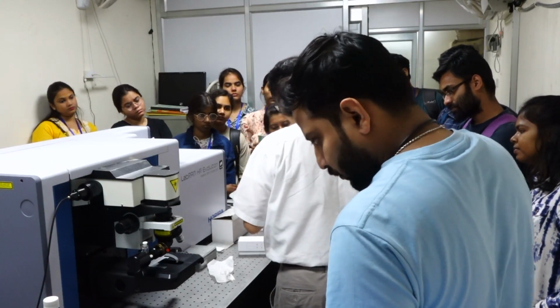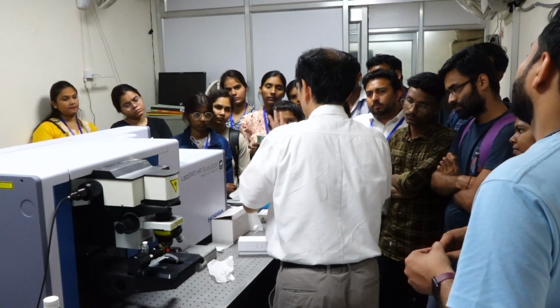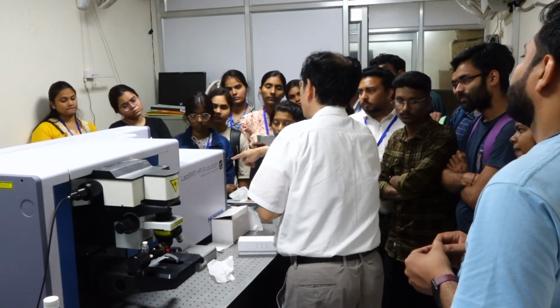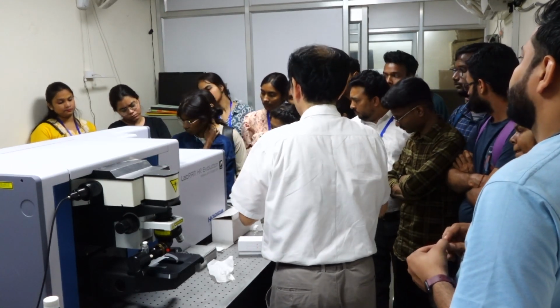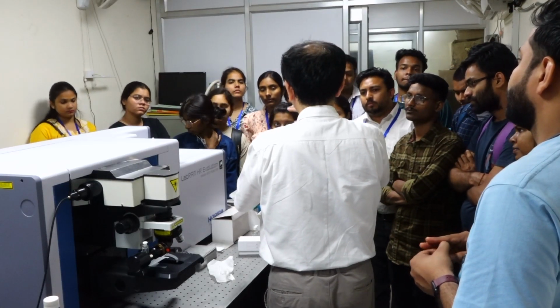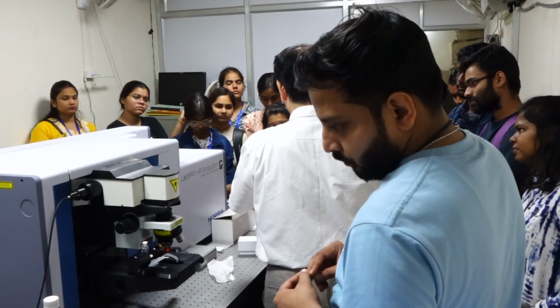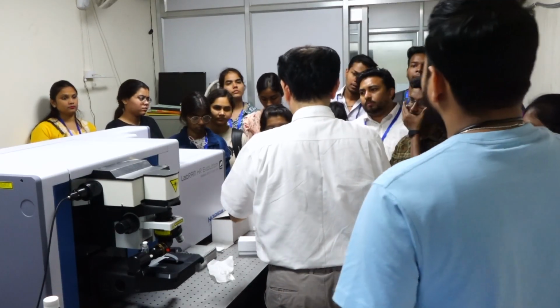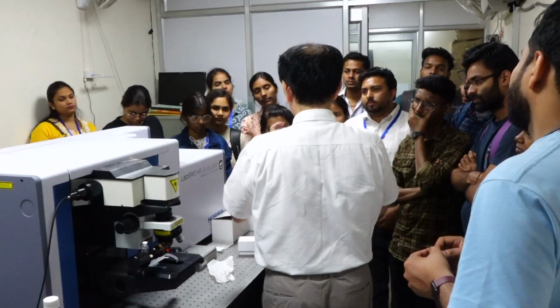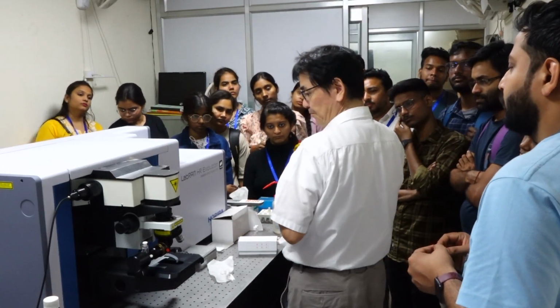So in such a case, we should lower laser power to keep photon density low. Accordingly, we cannot increase the Raman intensity so much. But anyway, the smaller the spot, the higher the signal is. So it's good.